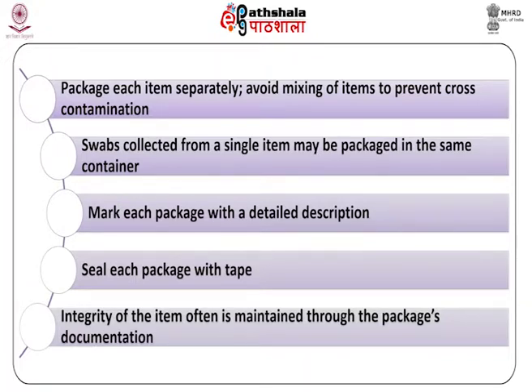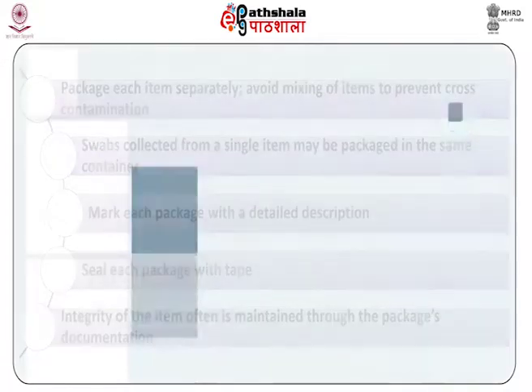The integrity of the item often is maintained through the package's documentation. The documentation includes all the markings, seals, tags and labels used by all the agencies that are involved. Therefore, it is critical to preserve or document all the packaging and the labels.